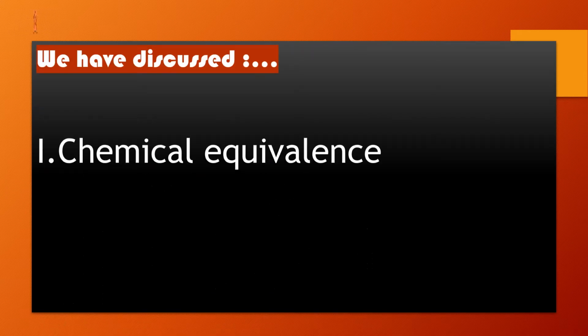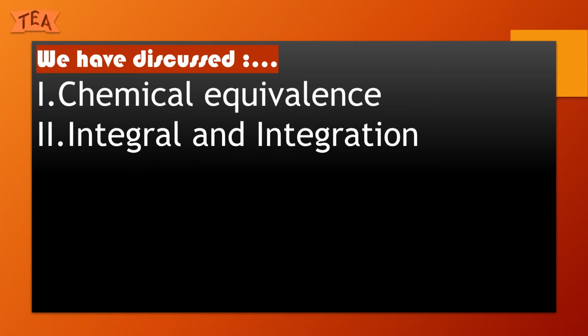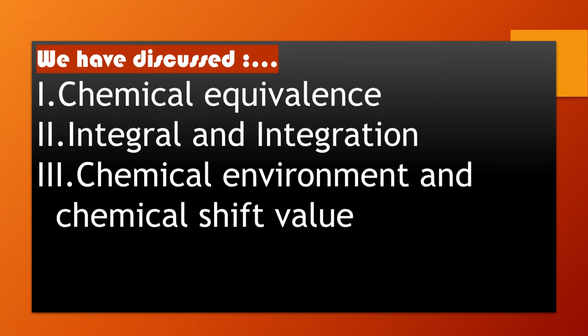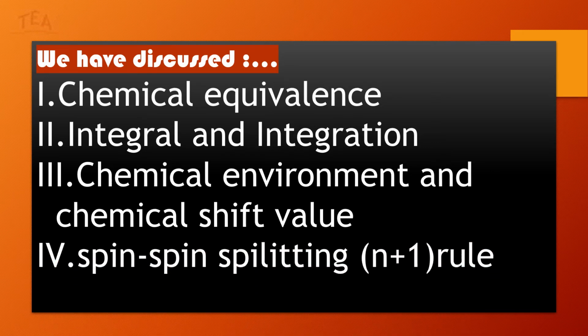Till now I have discussed briefly some important topics in H-NMR series which are required to solve simple H-NMR problems. So we have discussed chemical equivalence, integral and integration, chemical environment and chemical shift value, and splitting, that is the n+1 rule.